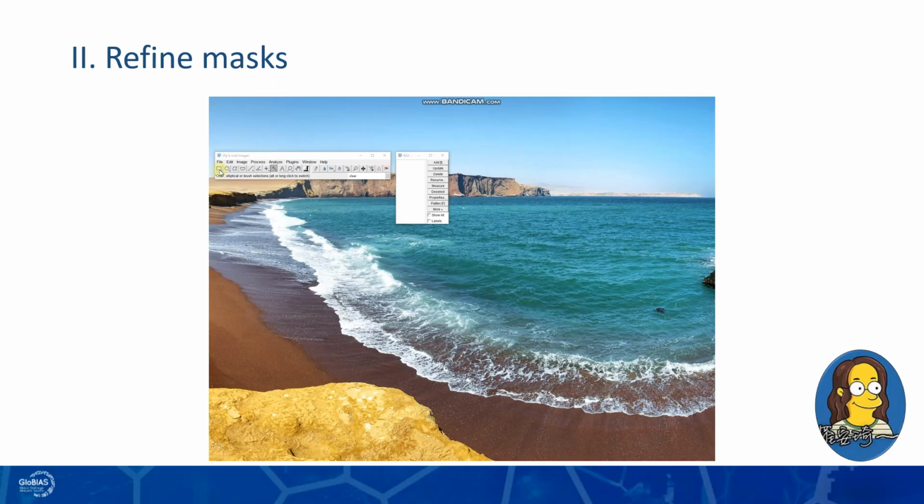At the previous step, we have obtained the initial mask images. However, segmentation output often contains imperfections that can interfere with downstream analysis. In the next demonstration, Angie will show how these masks can be semi-automatically refined by removing irrelevant objects, filling holes, and cleaning artificial debris to produce analysis-ready masks.